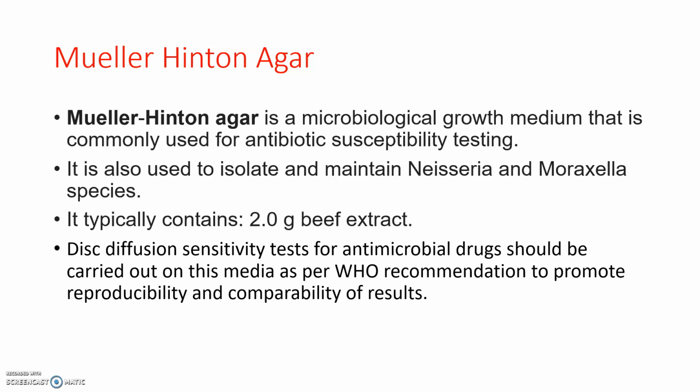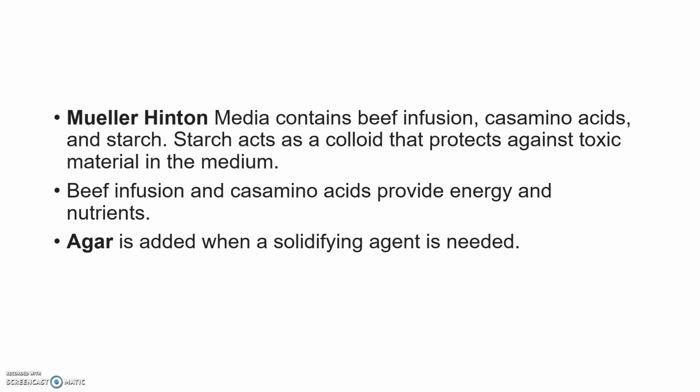A disc diffusion sensitivity test for antimicrobial drugs is carried out in this medium as per WHO recommendation, to promote what? Reproducibility and comparability of results. The Mueller-Hinton medium contains beef infusion, casamino acids and starch.